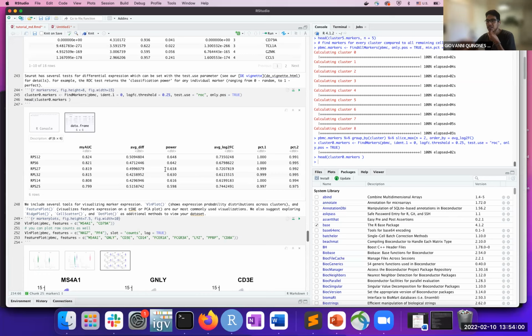To quickly explain what ROC is, it's a type of analysis, a type of plot that you do in order to test how good your classification is. I guess we don't need to go too much into the details for ROC, but the takeaway point is that the way you test how good the classification is, is based on this metric, which is the area under the curve.